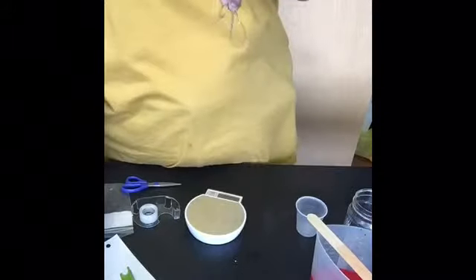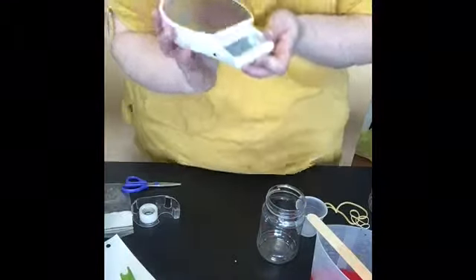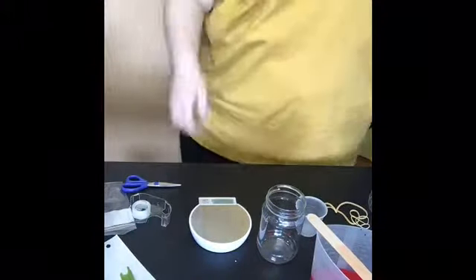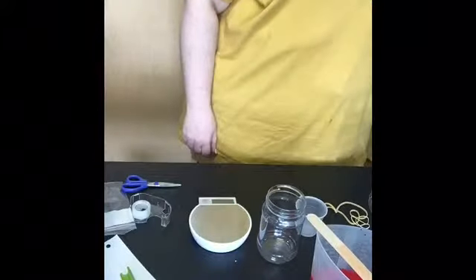I also have some rubber bands, which weren't on our materials list, but we'll need them to seal things up. I'm going to use a plastic cup and I have my digital scale. When I turn it on, I want to make sure it reads in grams, which it does. I'm going to recalibrate it so it's reading at 0.0 grams.